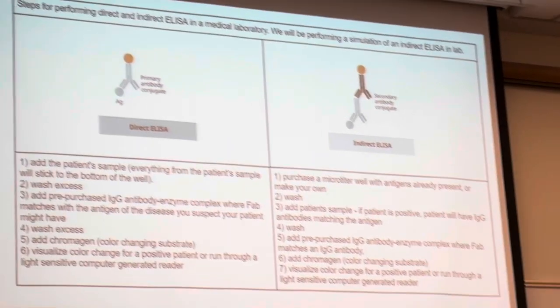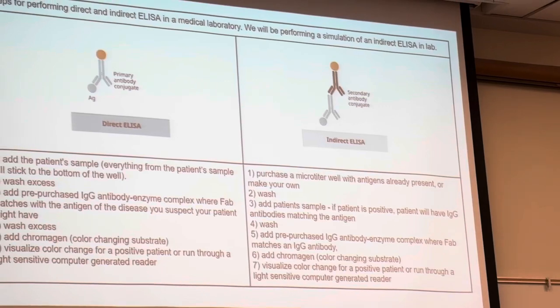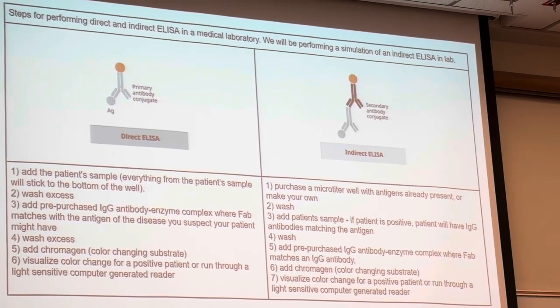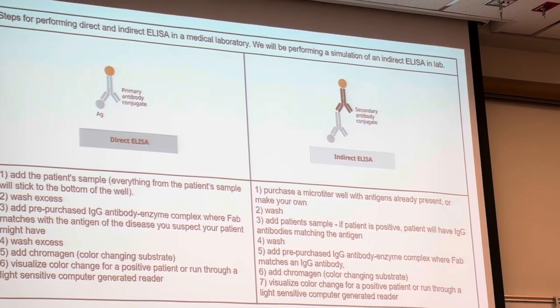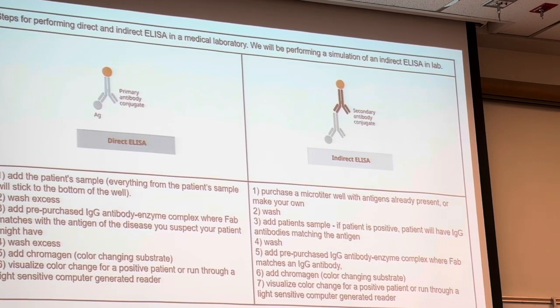Or, I don't know what my patient has. My patient's got some sort of virus. What am I going to do about it? How am I going to test? Am I going to test all the viruses? No, I'll probably try to find a faster and easier way to tell what my patient has. So there are a couple of different reasons why we use direct and indirect, and I'll walk you through those.